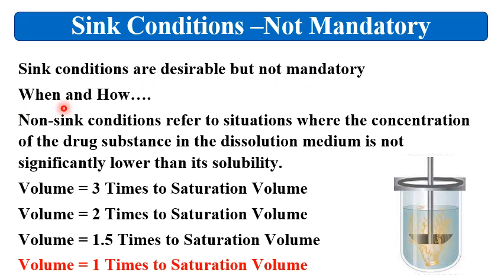Now see when and how the non-sink conditions can be taken into consideration. So non-sink conditions refer to the situations where the concentration of the drug substance in the dissolution medium is not significantly lower than its solubility.